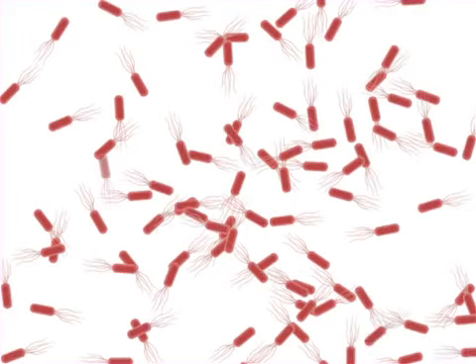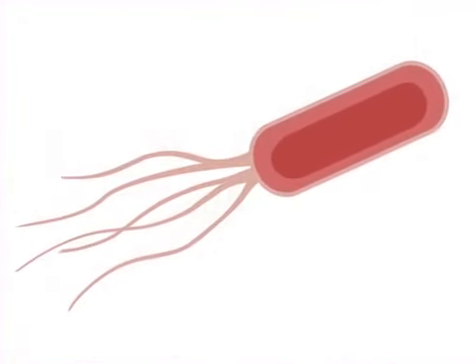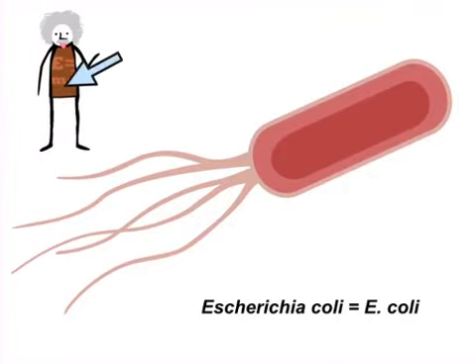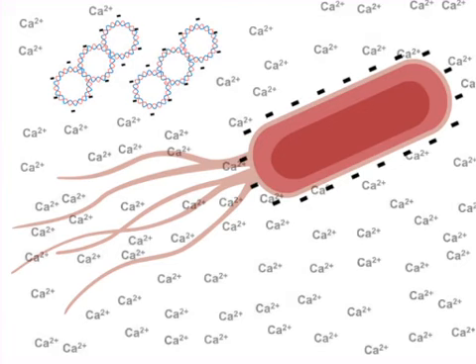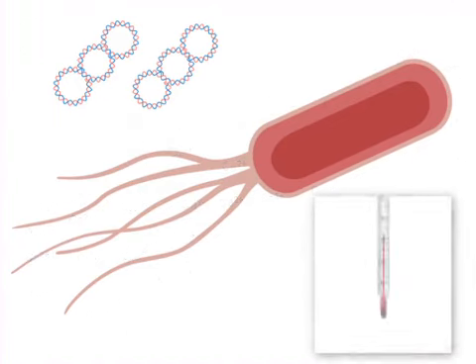Now that we've discussed plasmids, let's talk about the cells into which they will be introduced: the competent cells. The most commonly used type of bacteria in molecular biology research and transformation is E. coli, which happens to also inhabit your lower intestine. Cells are typically made competent via exposure to a calcium-rich environment. The positive charges of the calcium ions neutralize the negative charges of both the plasmid and the bacterial cell wall, dissipating electrostatic repulsion and weakening the cell wall.